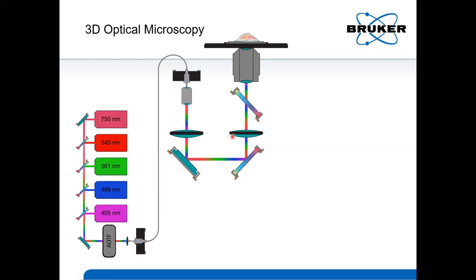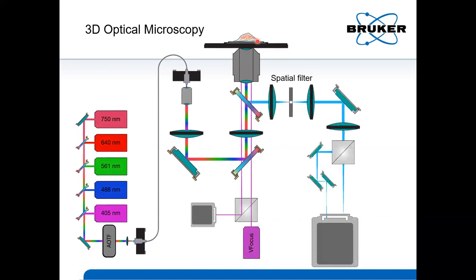While imaging, we have a V-focused drift correction system containing a separate 850 nanometer laser that bounces off the cover glass and is recorded on a separate camera. Any shifts in Z are recorded as a lateral shift of this beam and automatically corrected by a piezo during imaging. The emission path contains a spatial filter to remove any out of focus light. After passing through the spatial filter, light enters a 50-50 beam splitter that sends half the light to focal plane 1 and the other half to focal plane 2.